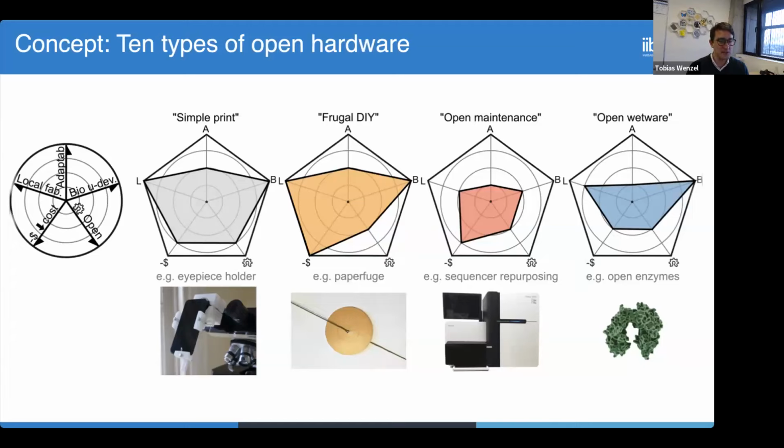And this is really important because this is a big disconnect normally in industry. Normally the people that design equipment are not the same as the ones that use it. And this is a big design challenge. This is why in the end, a lot of equipment is not very nicely designed from the user perspective, because it's very difficult to get that communication right. So if people can modify things themselves to make it suit themselves, you get much better solutions and more localized ones. Okay, so with these 5 categories in mind, let's look at different open hardware projects and see how they perform.